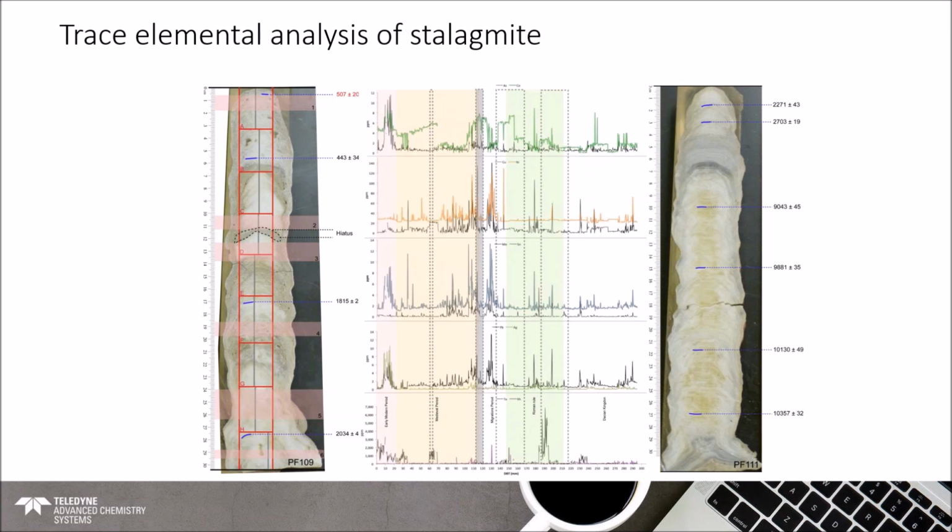And when you actually analyze these samples, we, and I'm using the word we very loosely in this case, someone other than I, was able to look at the specific growth band within the stalagmite caused by the drop in the cave, and be able to find the exact timeline in which that Roman mine existed. And you can actually see the gold layer that appears there in the middle.